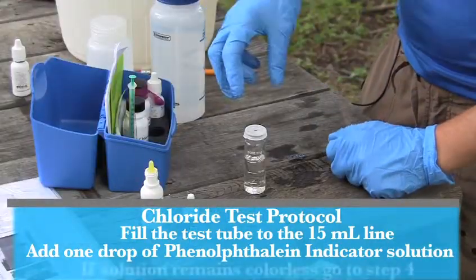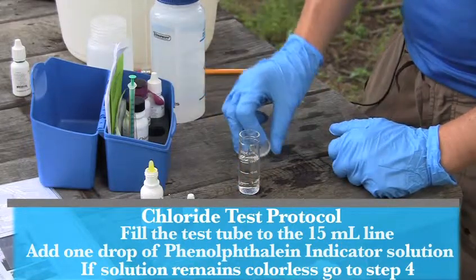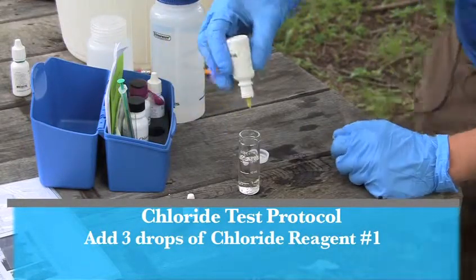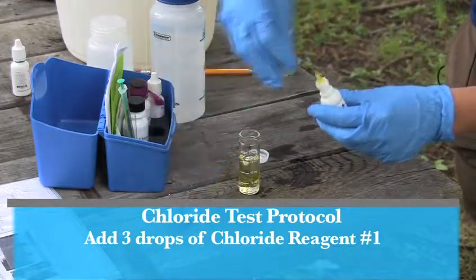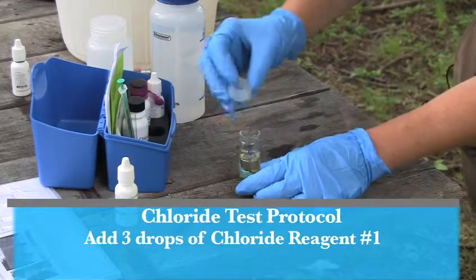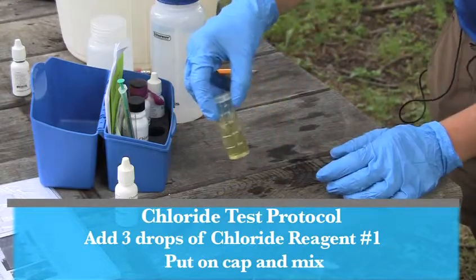If the phenolphthalein solution keeps the sample colorless, you skip to step four. Add three drops of the chloride reagent number one, and the sample should turn yellow. Put on the cap, being careful not to spill the sample, and mix.